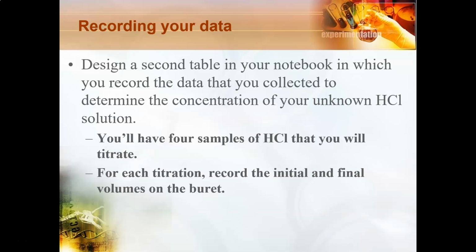If there's one of your titrations in which maybe you went over the endpoint, maybe you do another titration so that you have 3 good data points. So you'll need to record the initial and the final volumes on the buret, again, so that you know how much NaOH you added in milliliters.